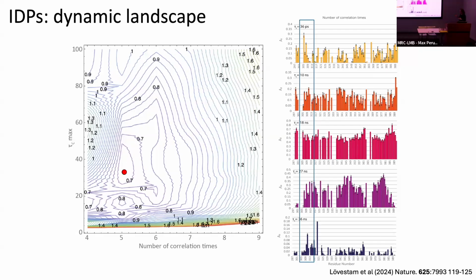It's only a very small population, but there is a FIA-related structural dynamic difference. So these residues are experiencing more segmental motion. They're in a structure that's much more similar to the FIA that we see in the time-resolved time course. So you can imagine that energetically, it's much easier for these residues to start to form the FIA than perhaps a completely disordered system would.